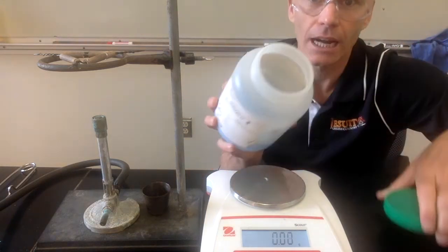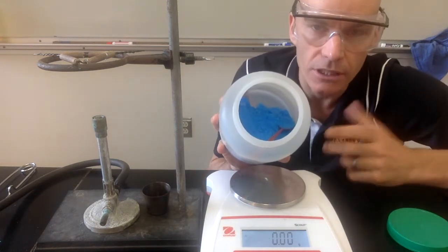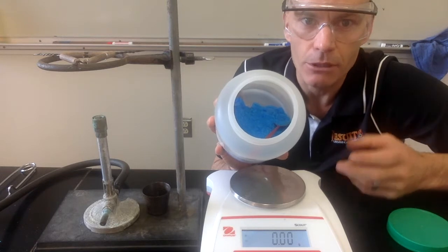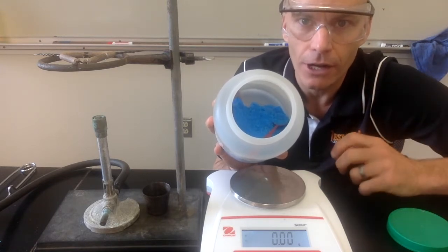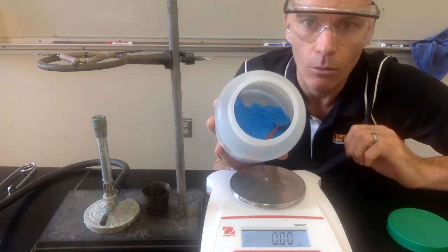Today we're going to be looking at copper sulfate hydrate. This is copper sulfate hydrate — it's a blue crystal, an ionic compound. It's a hydrate, which means there are water molecules trapped inside of it. Our goal in the lab today is to figure out how many water molecules are trapped inside — what's the ratio between copper sulfate and water?